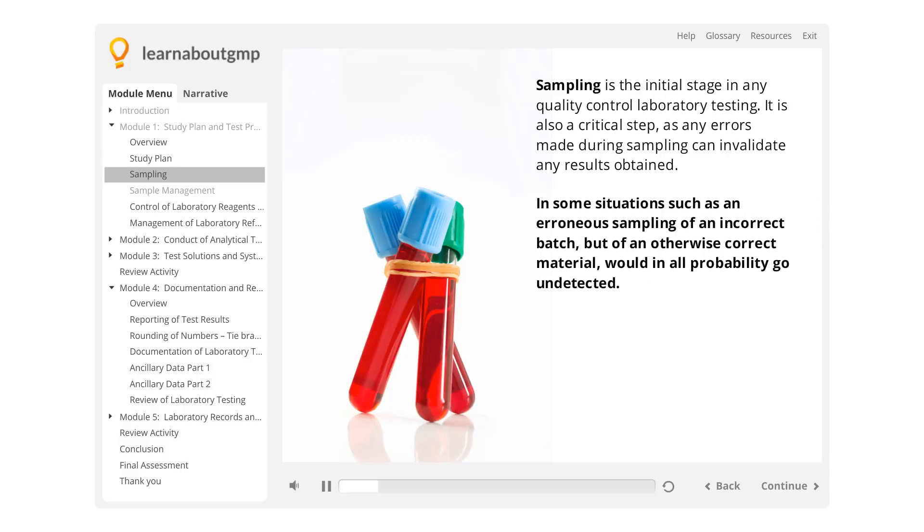In some situations, such as erroneous sampling of an incorrect batch but of an otherwise correct material, would in all probability go undetected. In light of this, the instructor advocates measures to verify correct sampling at the point of source.